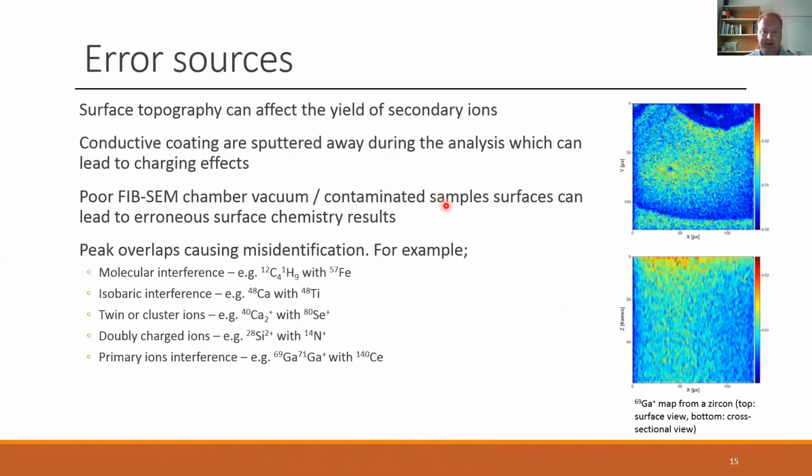So, vacuum and contamination issues. I mentioned that if you don't have a very high vacuum, or if you've dirtied your chamber using samples that are outgassing, things like that, you may have some contamination issues.